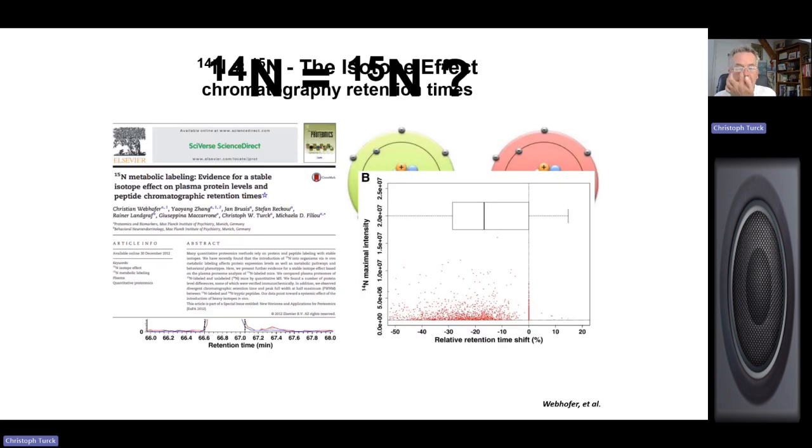Now, I'd like to finally talk a little bit about the isotope effect. This was sort of a fun project. It's commonly believed that 15N or 13C is not a big deal. There's just one extra neutron. Nitrogen has 7 neutrons, and in 15N you have 8 neutrons. Not a big deal, just one more neutron. It doesn't make a big difference, and for the most part this is accurate.